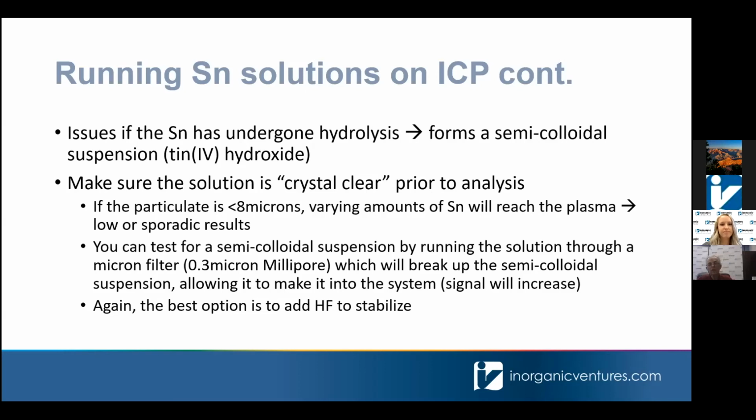What you need to get into your nebulization system is something that's just small. Autumn has 8 microns or less. So these large particles are not going to make it in, but they get broken up, and then you start getting the smaller particles in. So you're almost taking an approach like the slurry nebulization approach that Dr. Les Ebdon has written so much about in his research. So Autumn, thank you for that. Thank you, Paul.